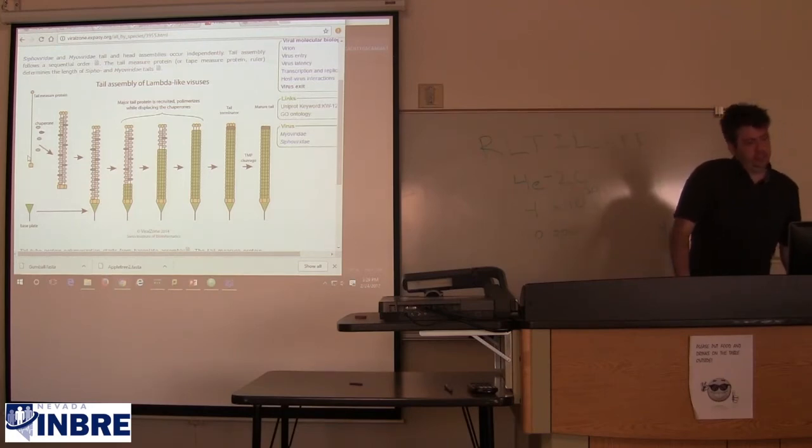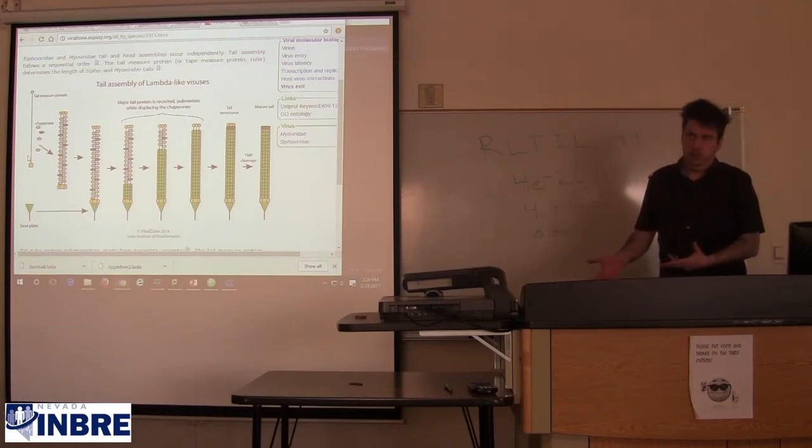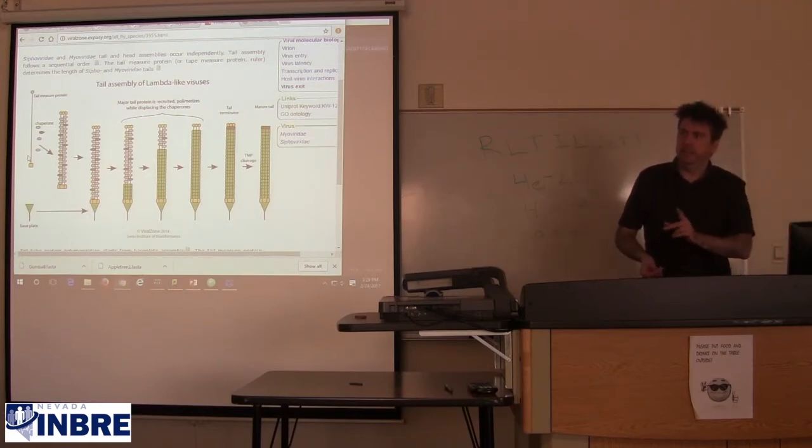So this gene that I'm giving you as the example is the cause of how tails get formed. But there's still a missing piece of the puzzle, because the sequence that I gave you should match 1,590 out of 1,590, not 1,589 out of 1,590.